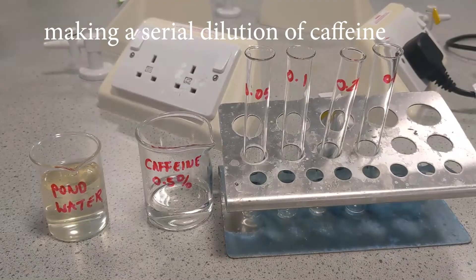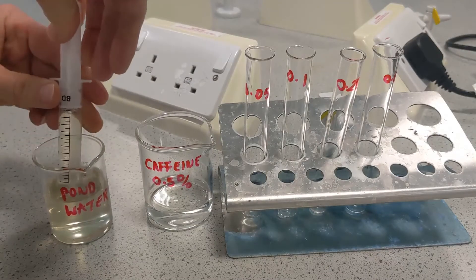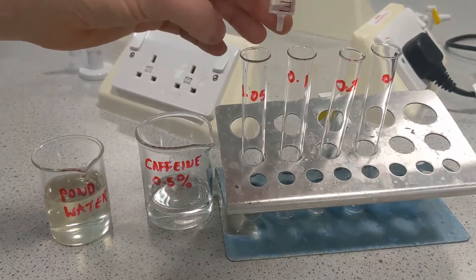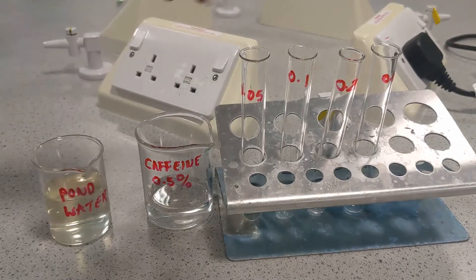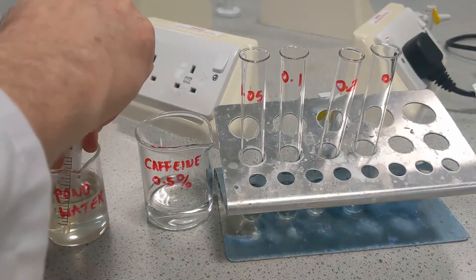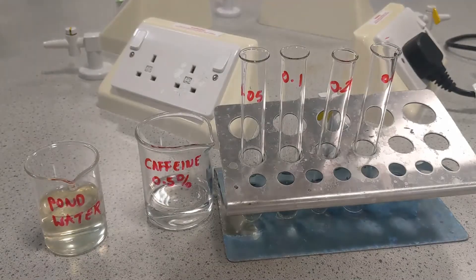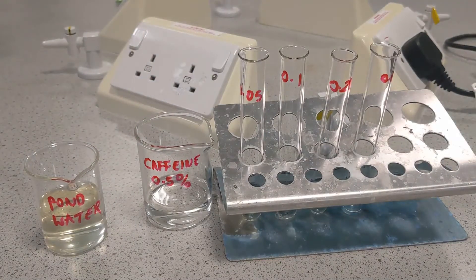I'm going to set up a series of dilutions of caffeine. Take 10 millilitres of pond water. In the first one we're going to put in 4.5, in the next one 4, then 2.5, and then in the last one no pond water at all.